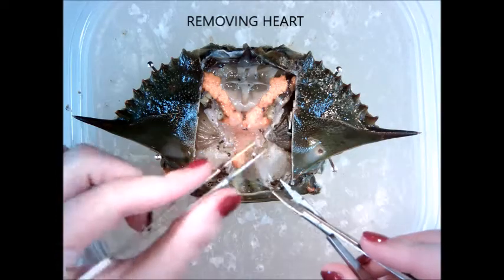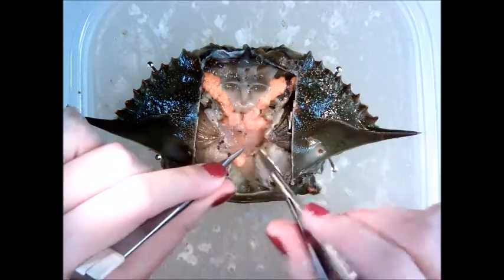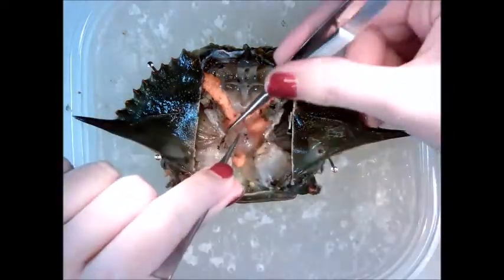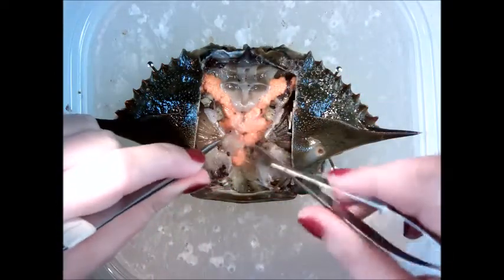Live crabs are placed under ice, which acts as a natural anesthetic. We begin the dissection by removing the dorsal carapace to expose the crab's internal organs. We then remove the heart, which contains the cardiac ganglion.